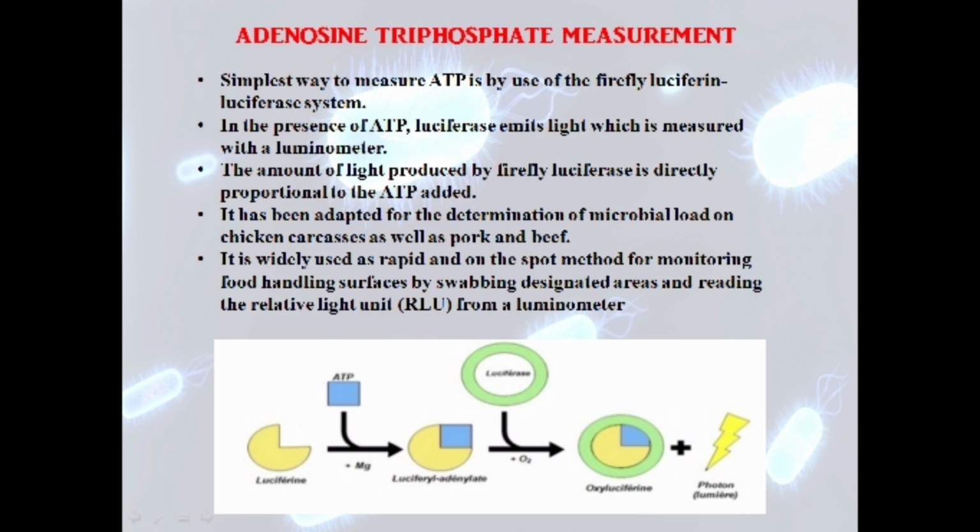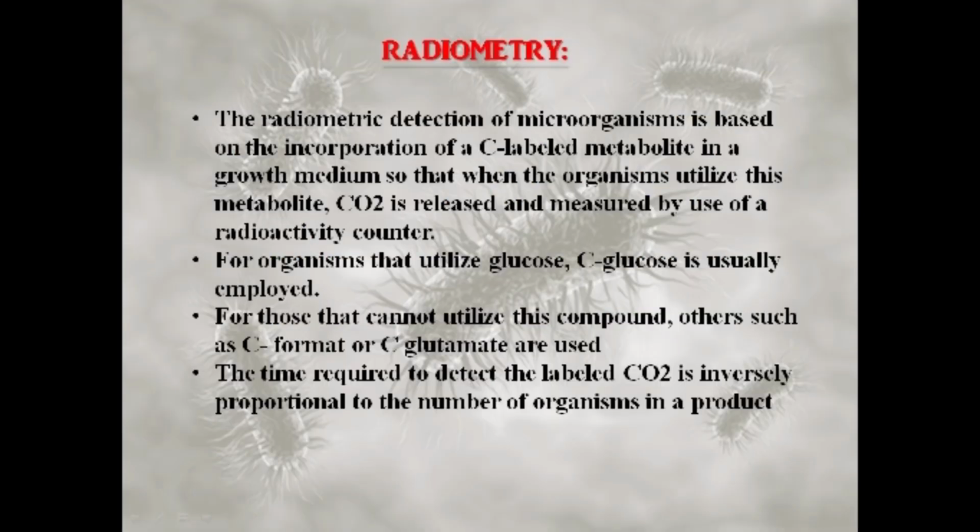The diagram shows the process of adenosine triphosphate measurement. Next, we move on to the topic radiometry.